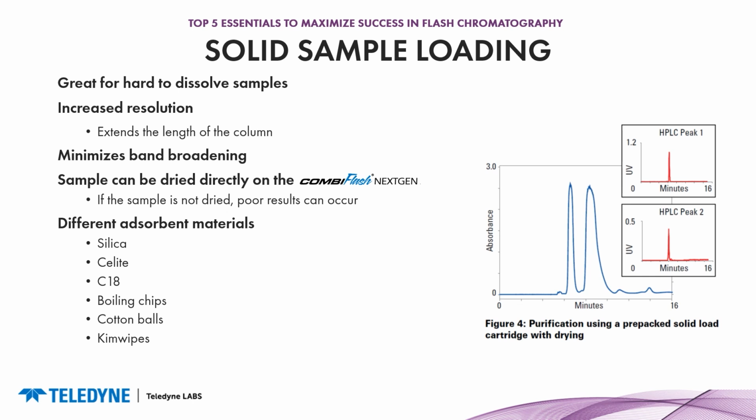You can use cotton balls and chem wipes if you have a spill in the lab and you need to use chem wipes to suck that up. You can still add those to a solid load cartridge to again improve your recovery.